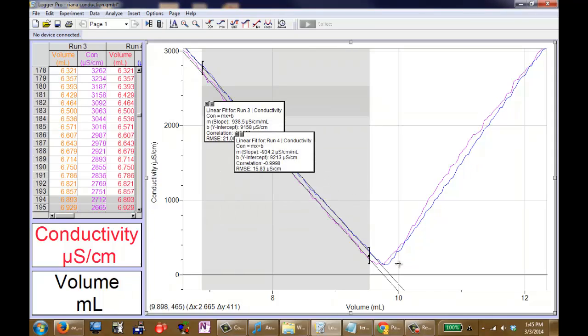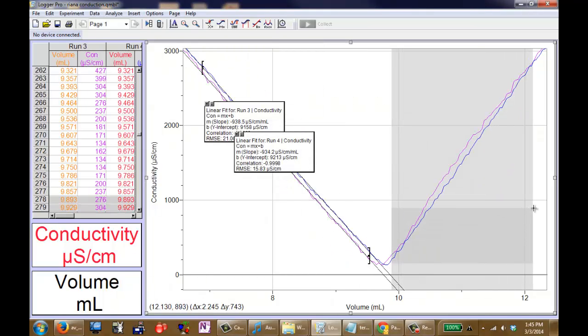We'll do the same thing on the other side, again asking Logger Pro to give us a linear interpolation on that data.